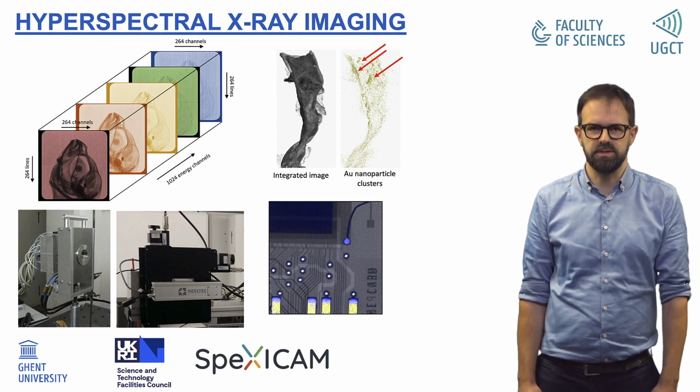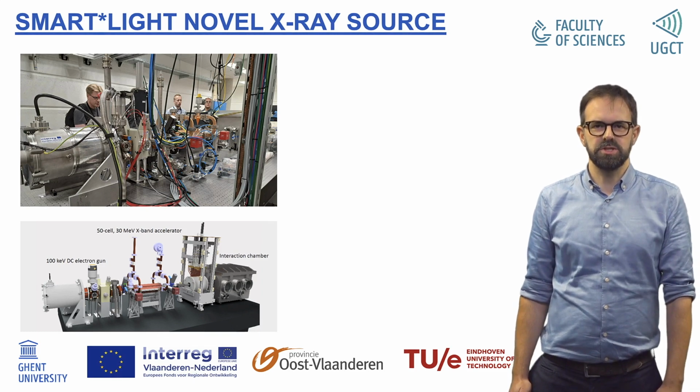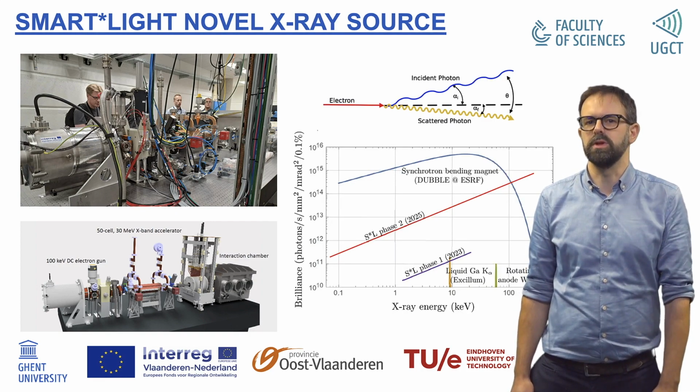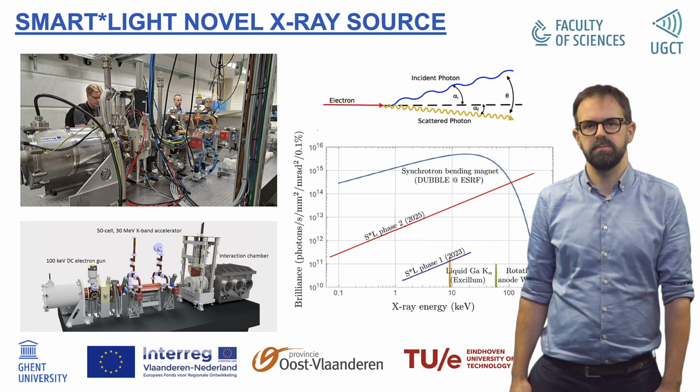In the Radiation Physics Group, we are doing pioneering research on the use of this kind of detectors in micro-CT. In terms of novel sources, we are investigating the potential in micro-CT imaging of a novel compact light source developed by TU Eindhoven. This source, based on inverse Compton scattering, will offer a tunable quasi-monochromatic X-ray beam with a high flux density. As such, this is a compromise solution between conventional, easily accessible lab sources having a limited beam intensity and huge, less accessible synchrotron facilities having extreme brilliance.